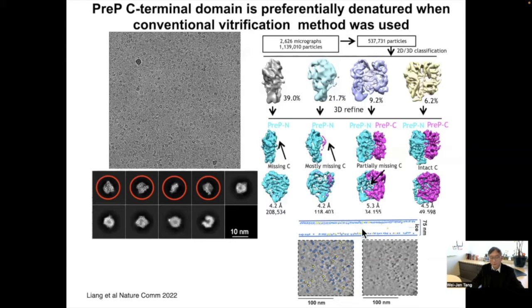We used cryo-ET to probe where the protein resides. Most of the protein is at the air-water interface, which tends to denature protein because of the hydrophobic nature of this interface. So we hypothesized we could use the Chameleon technology to reduce exposure to this interface and solve our denaturation problem.